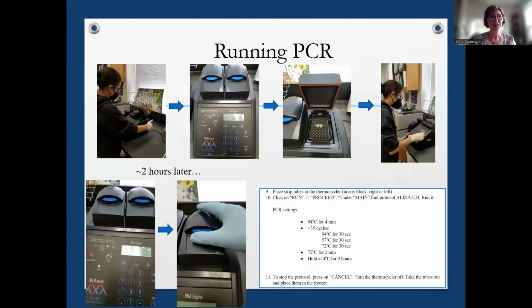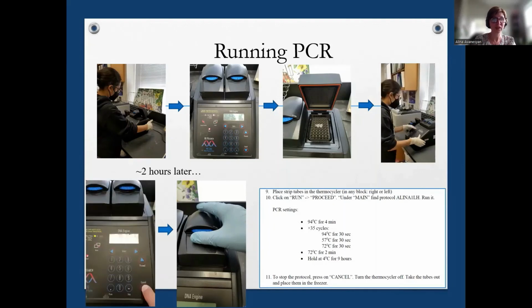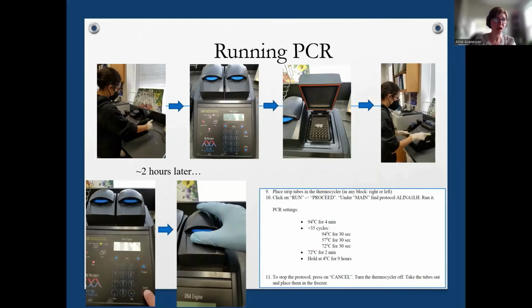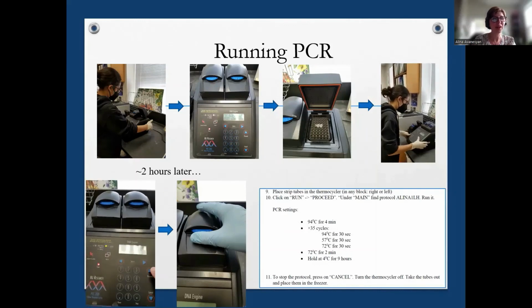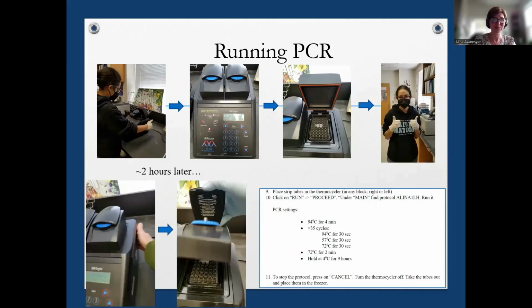We run the PCR in the PCR machine, which is on the bench near the window in our lab. For each species, we have a separate protocol, but typically any protocol runs for about 2 hours, after which the samples will hold for several hours at the fridge temperature until you come and take the samples out.